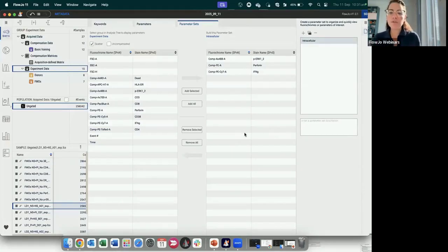Is it possible to zoom in on a single graph without zooming in on the whole screen? I haven't been able to do that, and it can be tricky. No, that's the answer. You cannot zoom in into a single graph. We are working on high graph resolution, so it will come. Just be patient.